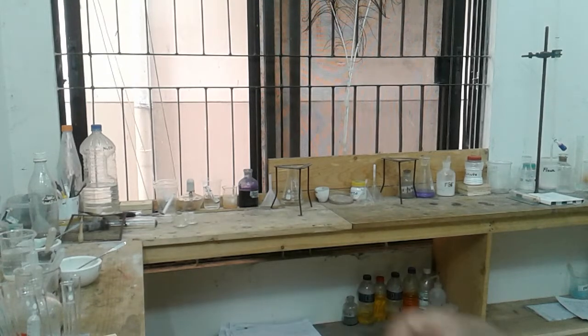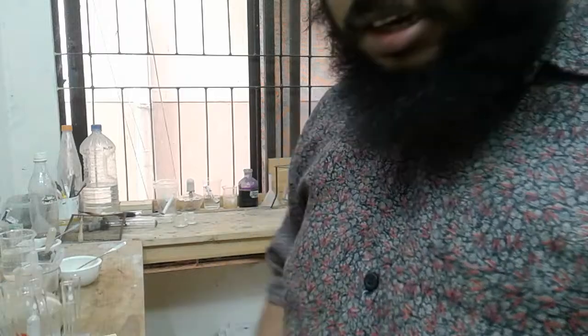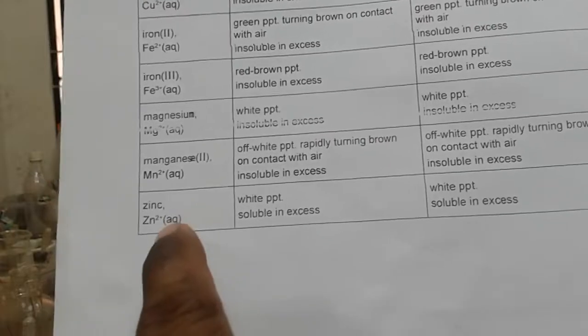Okay, so I've cleaned the test tube immediately because I don't like precipitate staying in test tubes if the question doesn't ask. Okay, so look, it's a type of white or off-white, whatever you say. It's an off-white.